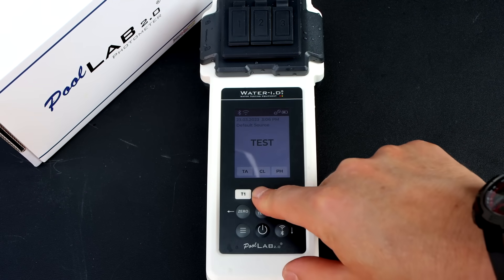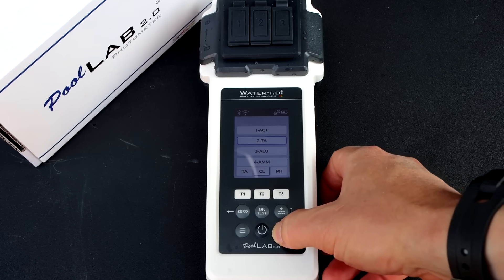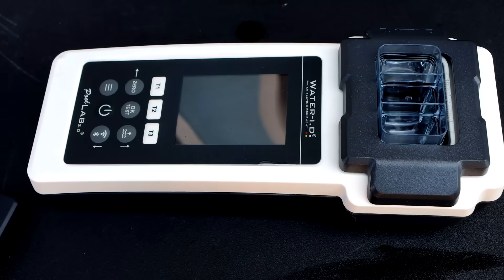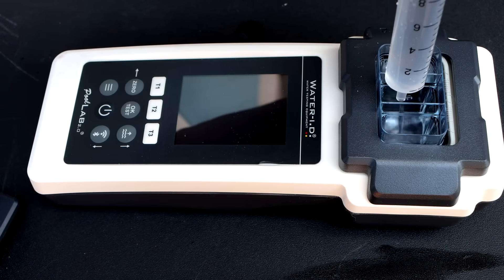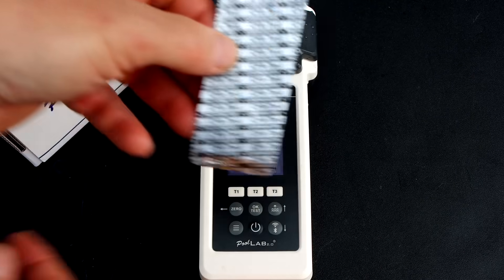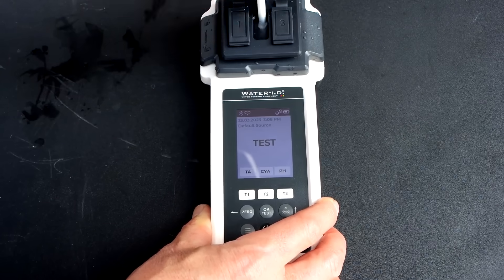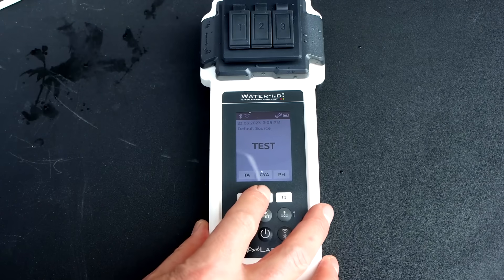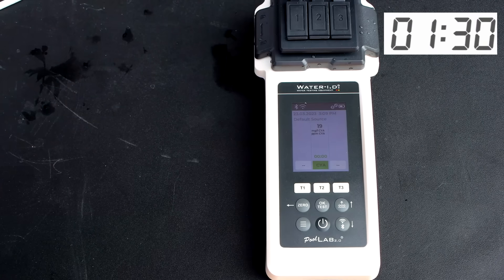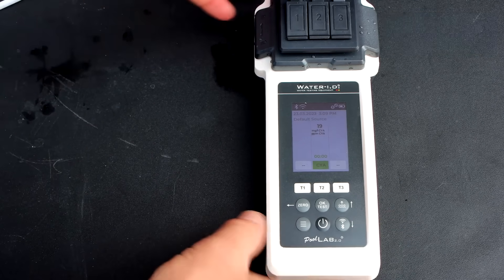You can also do a single parameter test by holding down test two, then scrolling between the different tests. I'm going to do cyanuric acid. When doing a single test factor, you want to use the middle chamber — this is the most accurate chamber, as it has four wavelengths while the other two chambers have three wavelengths. The cyanuric acid level is coming in at 19 parts per million.